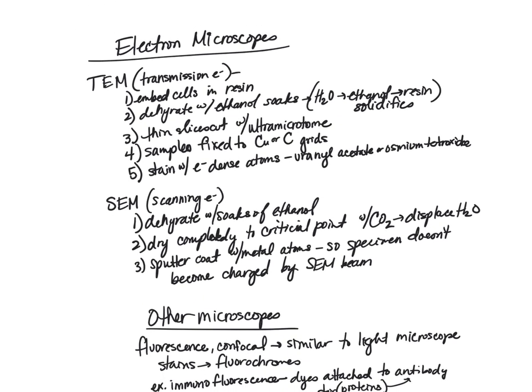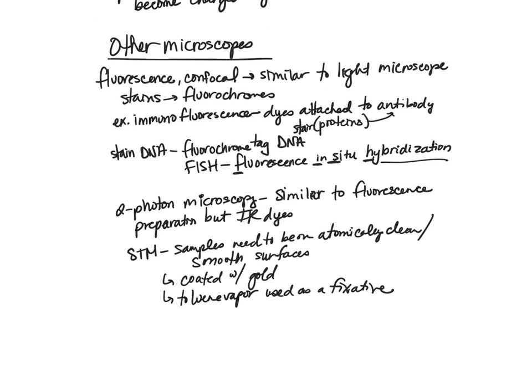And then you should know a little bit of detail about the electron microscope stains, these different steps that we spoke about here, and then just that little bit mentioned about the other microscope stains and preparations.